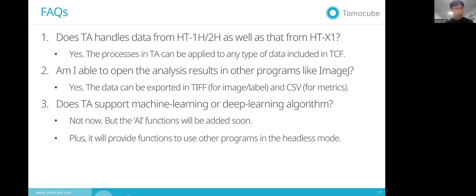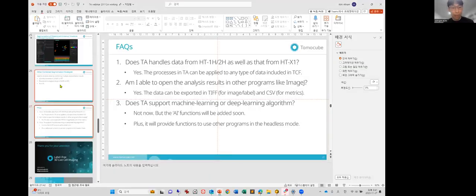And then I'll go into the real analysis based on the software. So I think I can get some questions from you, if there are any.